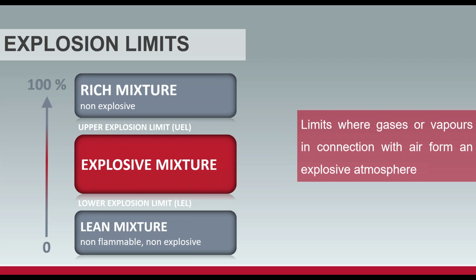Natural gas is a great way to think of that, right? There are natural gas explosions that happen quite often, unfortunately, if they're not too lean or too rich. The last scenario was too rich. There was too much chemical in that bottle. It only became flammable and non-explosive. So the whole fun behind this is ventilate, ventilate, ventilate. Make sure you have the proper air changes in your rooms, in your storage rooms, in your facility, and in your cabinets. Yes, in your cabinets.